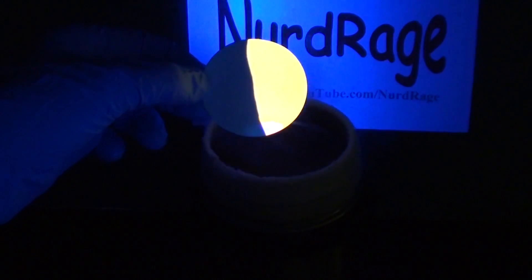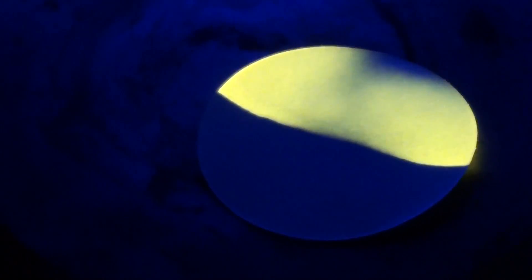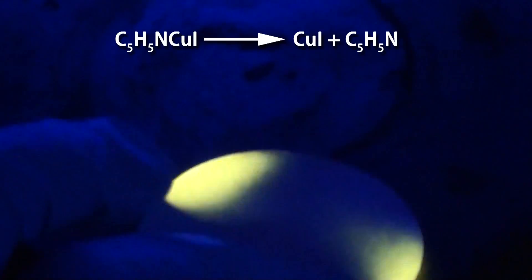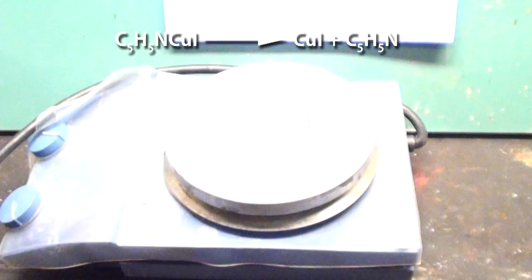Now you're probably wondering what would happen if we heat it too much. Let's give it a try. Looks like we're destroying its fluorescence as we liberate the last pyridine molecule and leave behind copper iodide and various forms of copper oxides.